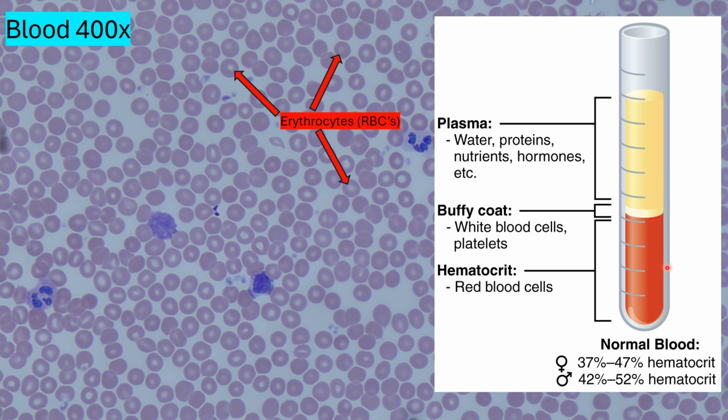The hematocrit here at the bottom, it's the densest. That's where we see our erythrocytes, our red blood cells. Now, they primarily function with transporting oxygen, and their shape's a little bit unusual. Like over here, it kind of looks like a donut, actually. There's not an actual hole here in the middle like there is in a donut, but it's really thin and it appears transparent. Depending on the angle, like some of these over here, you don't see that hole, but there is technically a spot where there's something missing. And that thing that's missing is the nucleus, because red blood cells, they used to have nuclei, but they lost them during development of the cell.